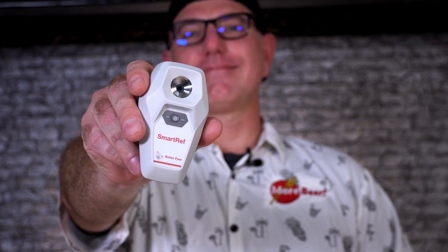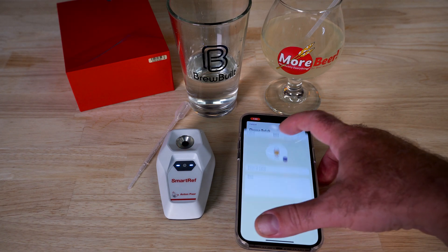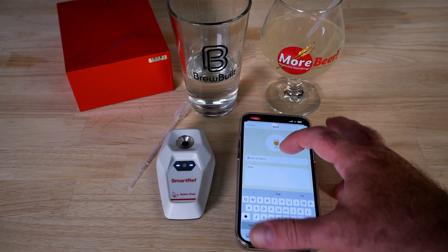It's not just for beer and winemaking. You could use this if you have a saltwater fish tank — you could measure saline levels, you can measure sugar levels of fruit. For winemakers, being able to take a grape reading of your fruit in the field is awesome as well, or any other fruits for that matter. It's a highly versatile tool with a lot of features.